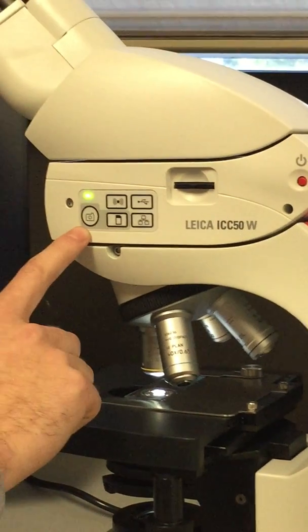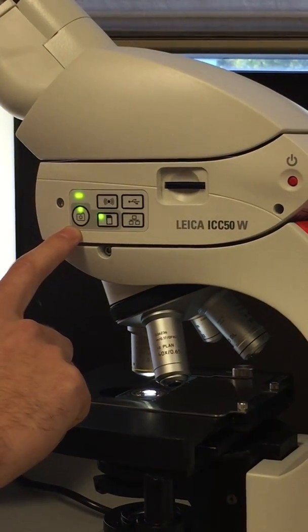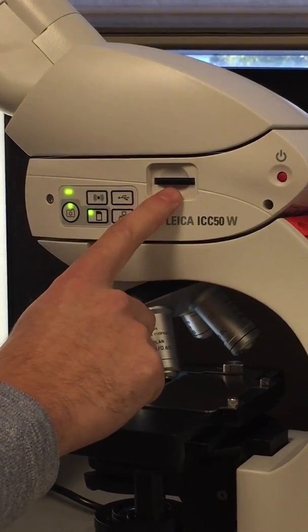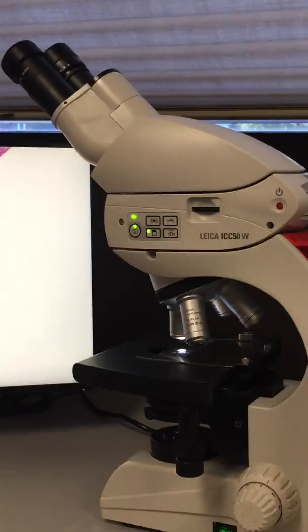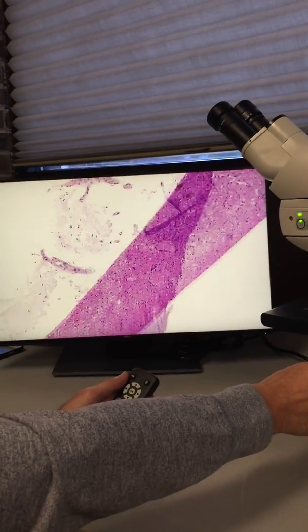The other button on the camera is the image capture button. By tapping this, you will capture an image directly to the removable SD card here. Now that the camera has booted up, you'll notice that you have a live, real-time image of your sample.